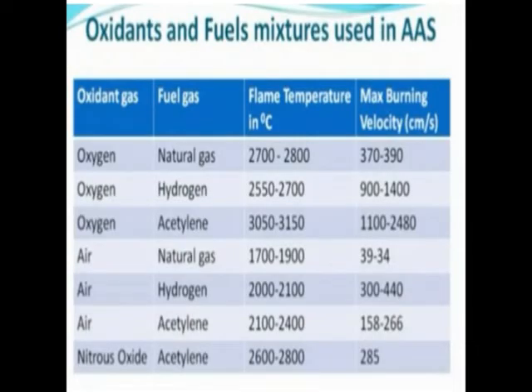Okay, so if the oxidant gas is oxygen and the fuel gas is natural gas, then the temperature of the flame becomes 2700 to 2800 degrees Celsius.